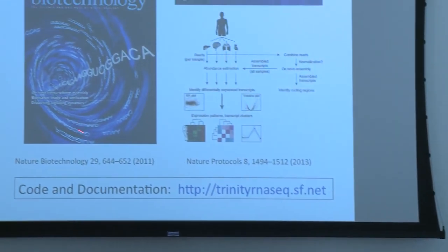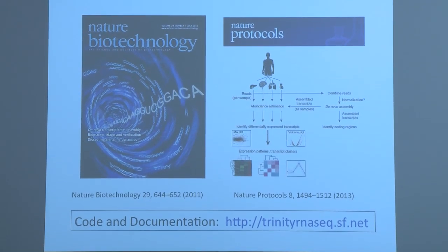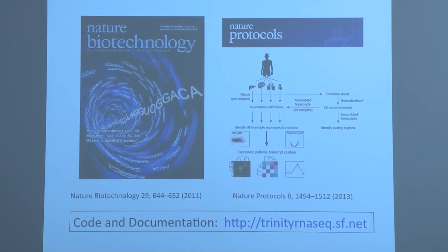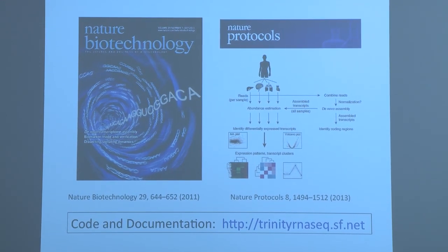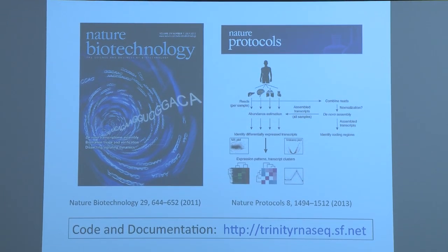We published it in 2011, and we actually made the cover of Nature Biotechnology. I really love this cover, and I thought I'd mention that it's been the wallpaper on my cell phone since 2011. I just love it. It's such a beautiful image. Anyway, so we published it, and last year we followed it up with a Nature Protocols paper that basically walks users through how you generate an assembly from RNA-seq data using Trinity, but more importantly, what do you do once you have an assembly, right? Because that's really a starting point for doing downstream analyses.